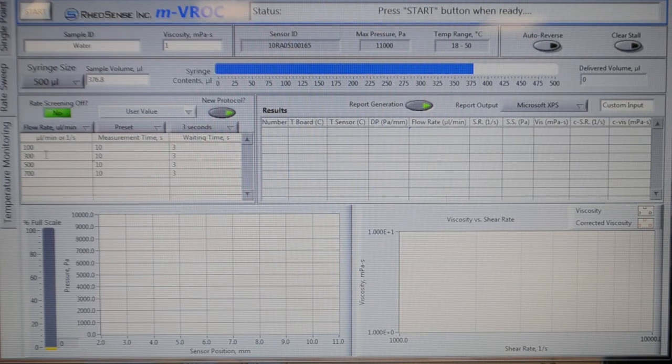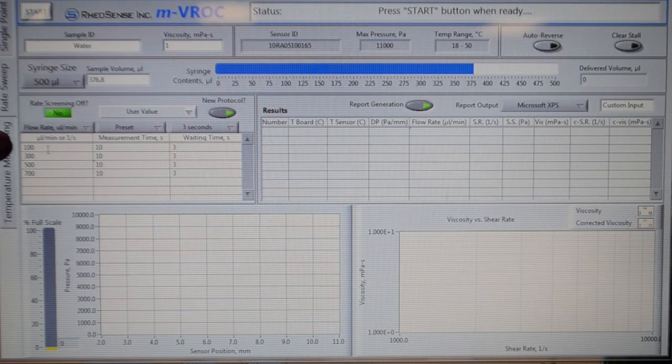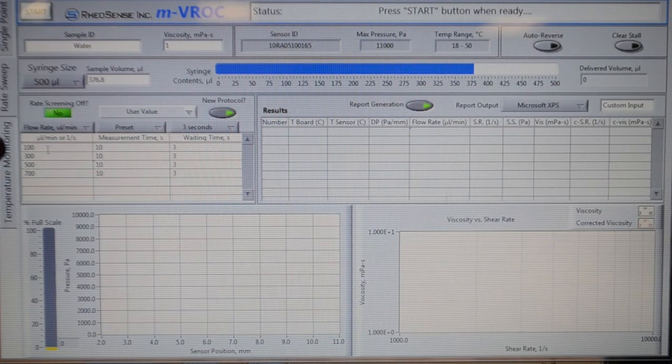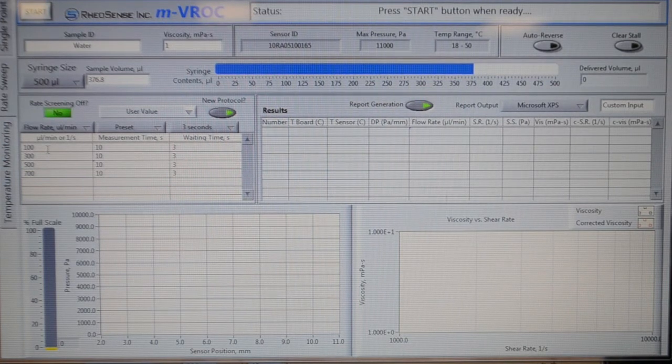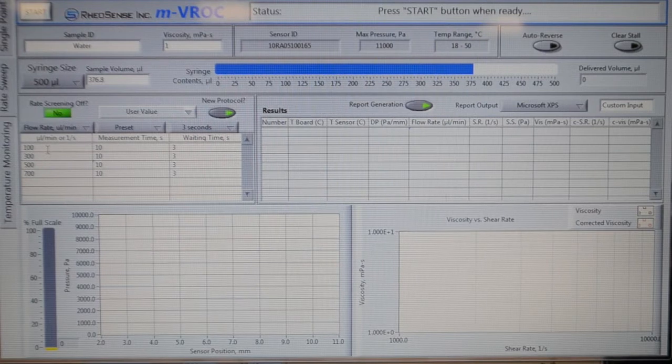Set your flow rate to 100, 300, 500, and 700 microliters per minute, or any other customized setting.